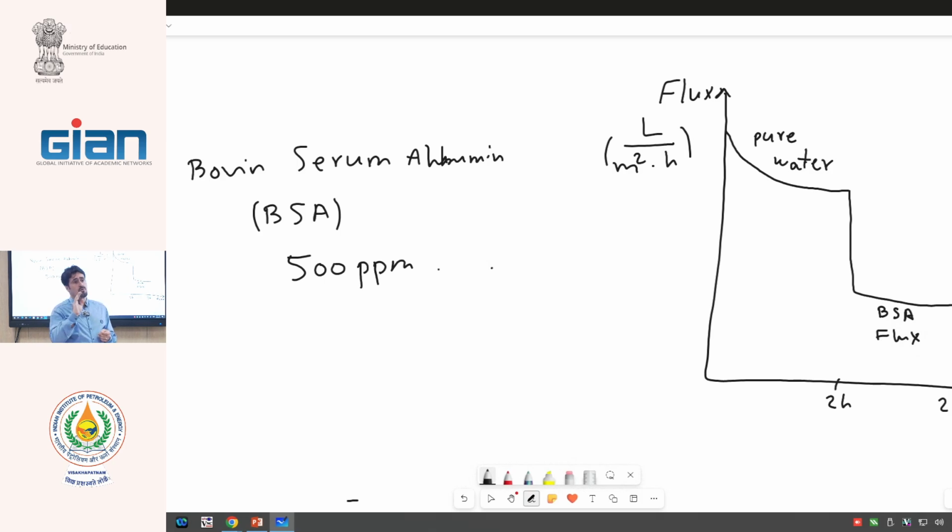We usually do not use cleaning agents such as acid or base. After 20 minutes of washing, usually with water, we measure the membrane's pure water flux again. We call it the second flux.